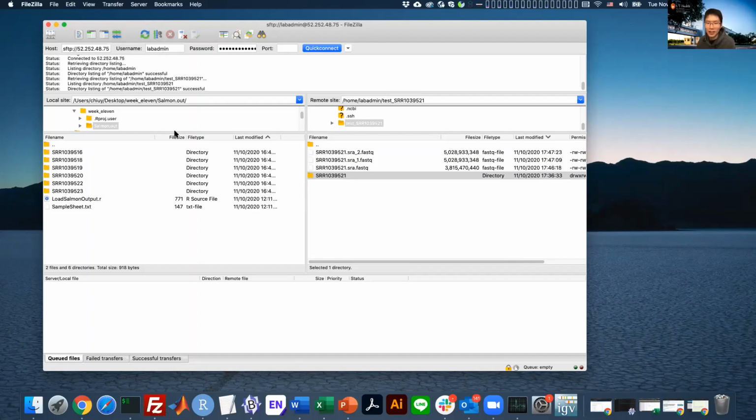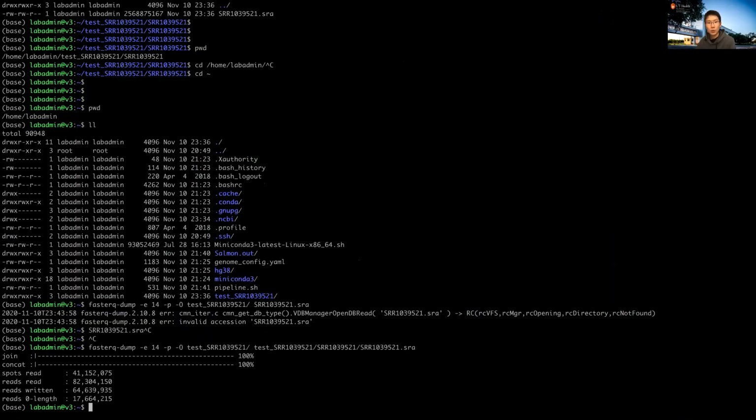So you can try any of the FTP client software. Okay, so this one's done. FileZilla works for Windows as well, so you can install FileZilla, or pretty much any FTP software, on both Windows and Mac. But MobaXterm already did it.